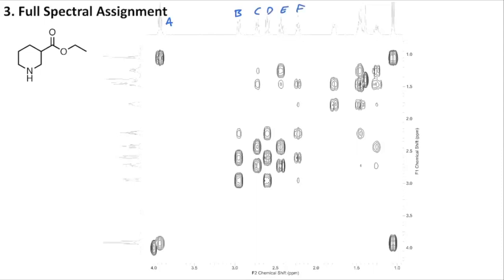And you should notice that this COSY example is plotted differently than the previous few examples that we've looked at, where before we had the low end of our axes at one side and then it was at the symmetric place on the graph on the opposite axis, but here it's actually plotted differently. So you just want to pay special attention to how you are labeling your peaks to make sure that you don't accidentally mislabel this peak as A, that one is actually J.